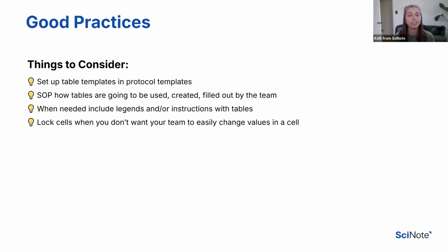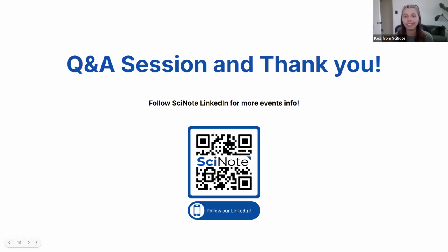All right. So with that being said, we can jump over to our Q&A portion. I know we have some questions filing in, so we're just going to start from the top, and I'll read our first question. When importing into the new table, the column titles did not carry over from the exported file. I think they're talking about what you showcased that's coming next week. I don't know if you want to pull that up, Alenka. I can do that. Yeah.